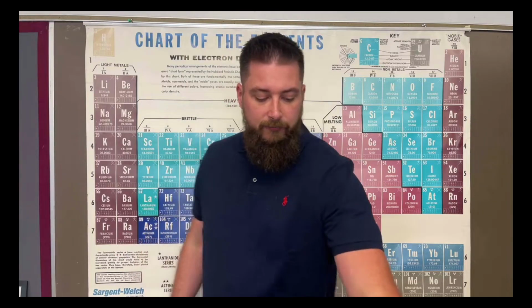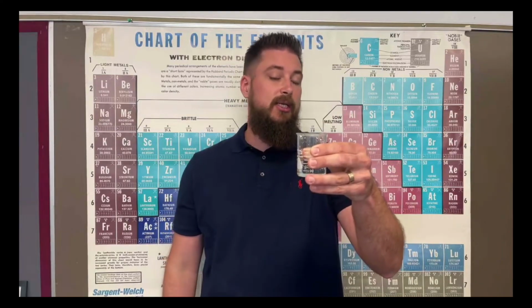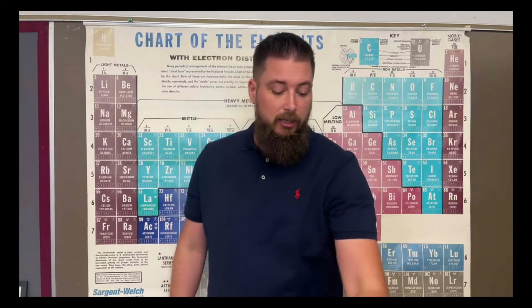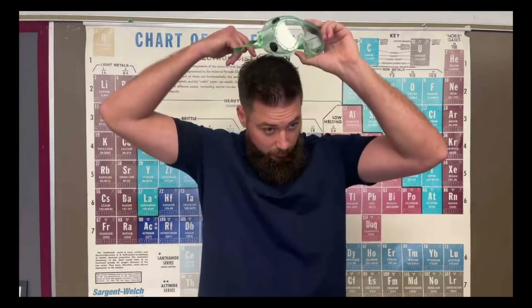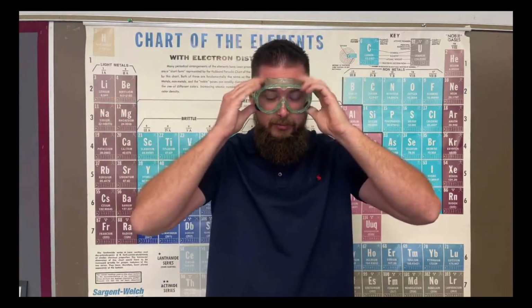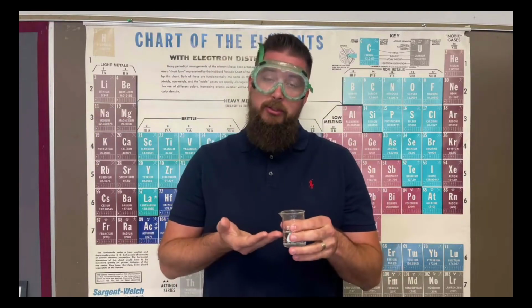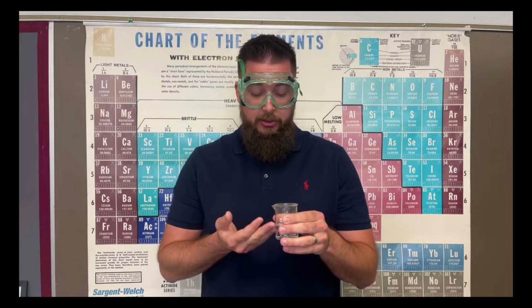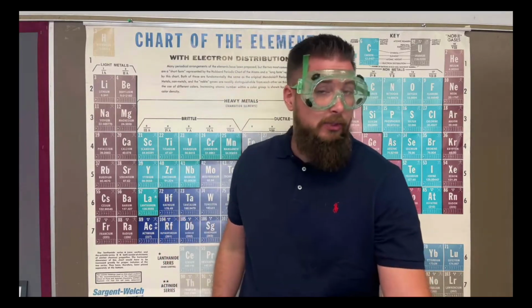And so first off, we're going to start off with this here. This is some sort of acid or base. Before we get started, we want to practice lab safety by putting our goggles on. All right. Now, I'm going to just tell you that this is an acid, just because I know what I put in there. But let's say that we didn't know.